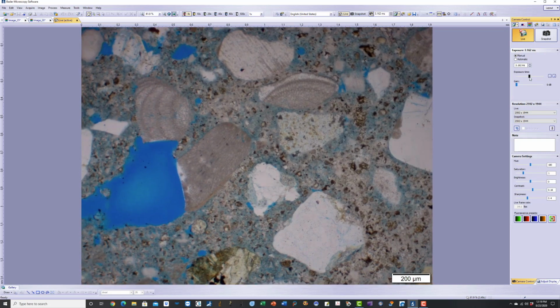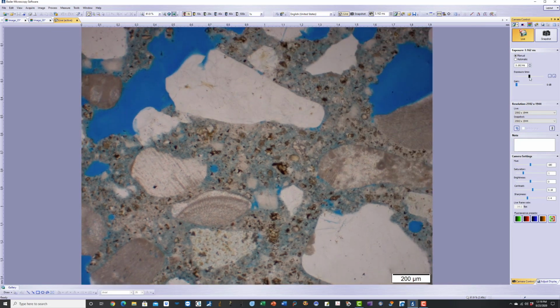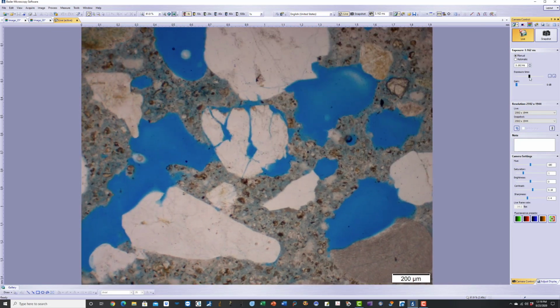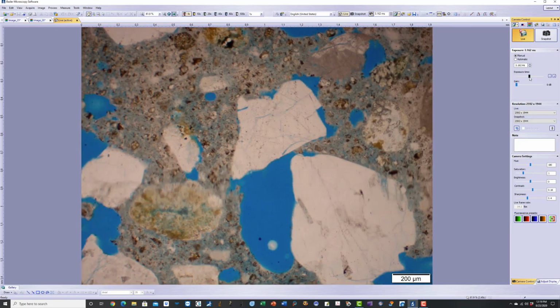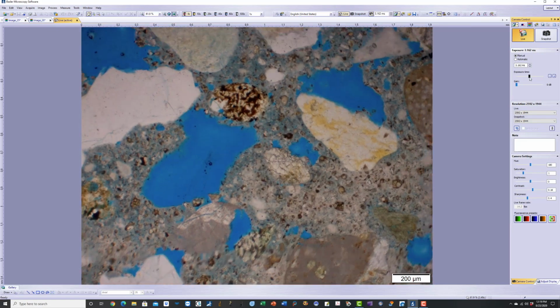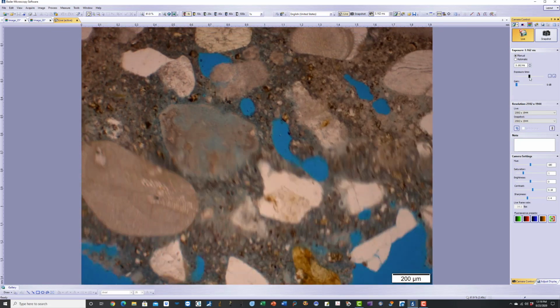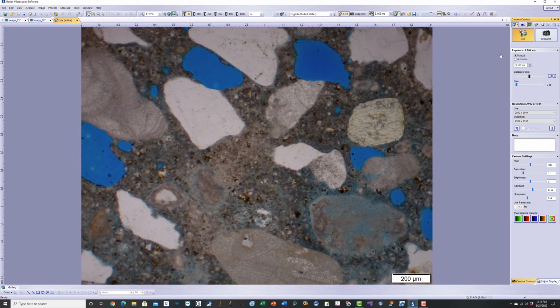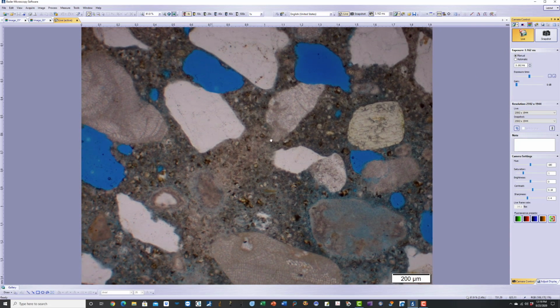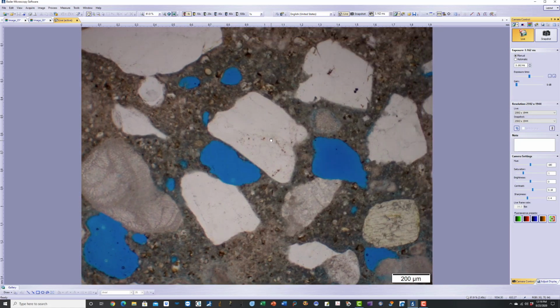About 15 to 16 of that 20 millimeter thickness is this kind of semi-porous, semi-dense paste, more or less uniform cement hydration, and then comes the denser paste. The entire region of the mortar coating should have been as dense as this portion. The entire part of the mortar coating should have been this kind of dense paste, which is only present at the surface. And in this case, the dense paste is by virtue of the carbonation of the paste.